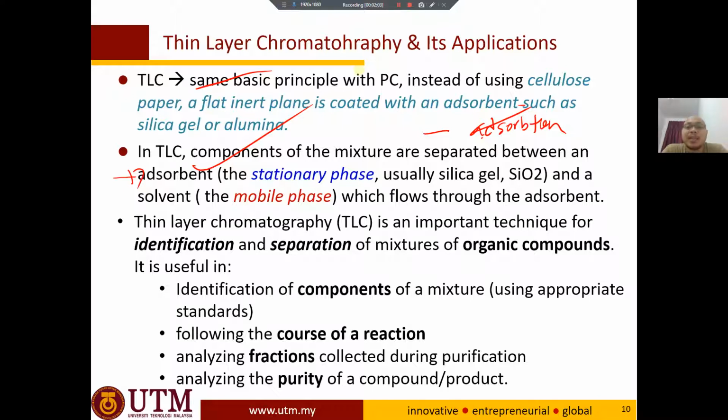But paper chromatography is the old technique actually. After paper chromatography, the TLC was developed, and the TLC is much more versatile. Today, paper chromatography is just for basic screening, to know how many components there are, but they don't really use paper chromatography for further analysis.